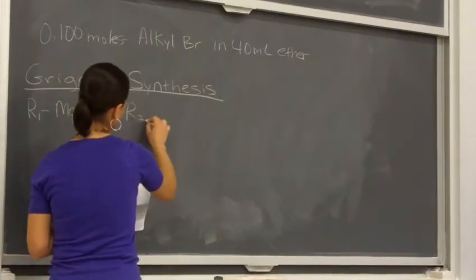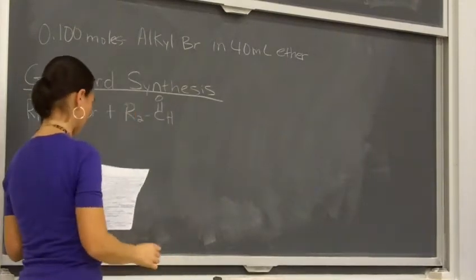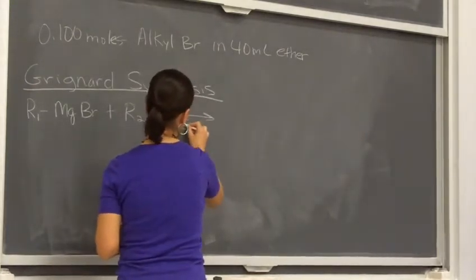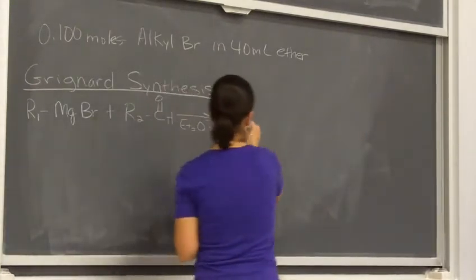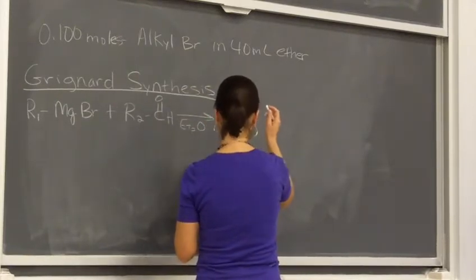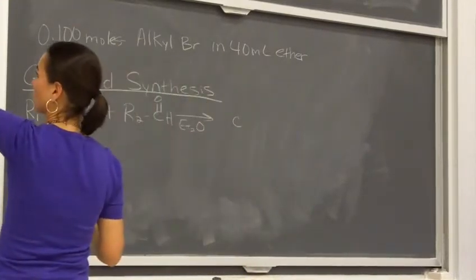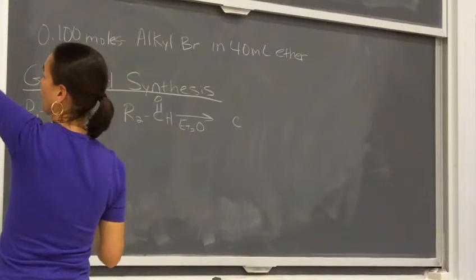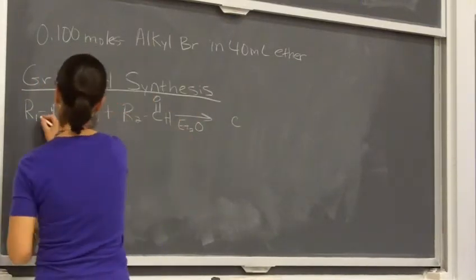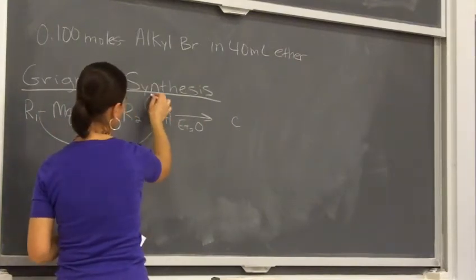Then we're going to work on this part of the reaction, okay? So we're going to add our aldehyde. And again, everything is still in ether, okay? So what we've got so far is that partial negative charge on our carbon from up here, okay? Now that's going to actually attack. So this carbon, that partial negative charge, is going to attack our aldehyde, okay?